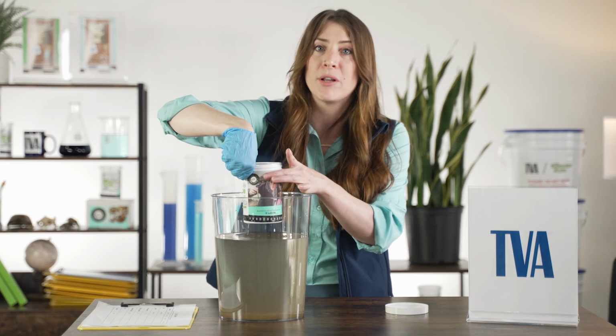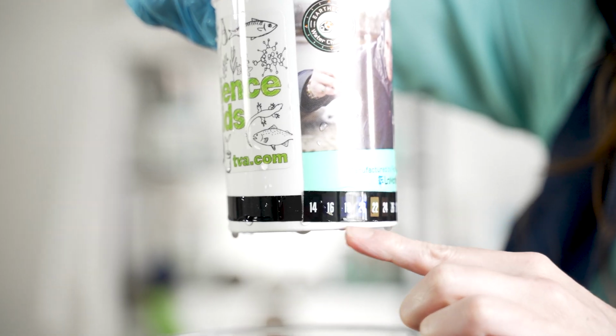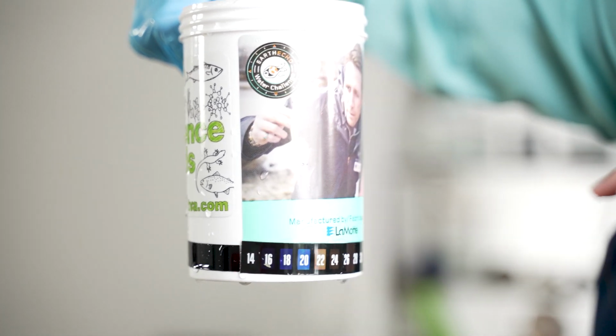Count for 30 seconds. That's 30 Mississippis. Once you've reached that, you'll pull the beaker out of the bucket and check the thermometer. You're going to be looking for the brightest number that you can read on your thermometer, and that is your accurate water temperature. Record that on your data sheet and don't forget to use your units of measurement.